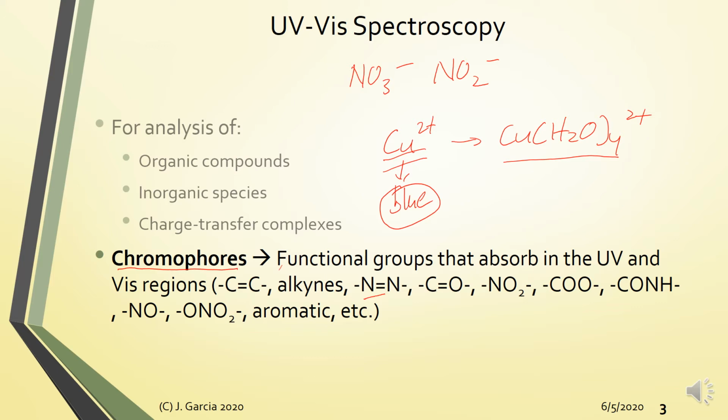So, the nature of these bonds in terms of energetics is that the energy difference between the pi bonding and the pi star antibonding levels, medyo magkalapit, in such a way that UV-Vis radiation is enough to excite electrons, okay, towards those higher molecular orbitals, or higher molecular energy levels.